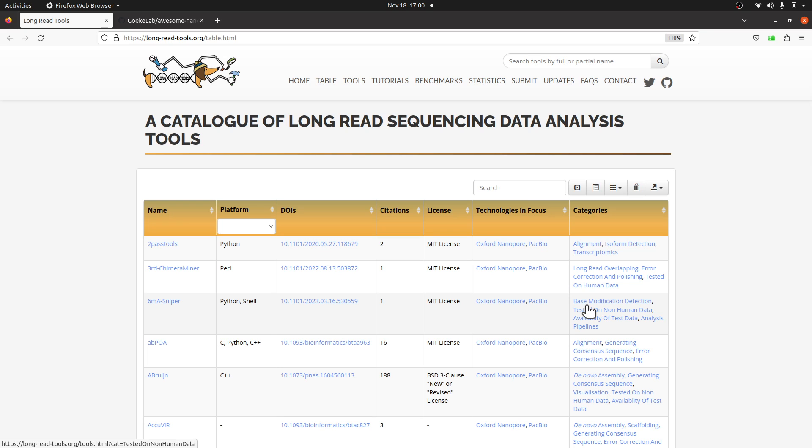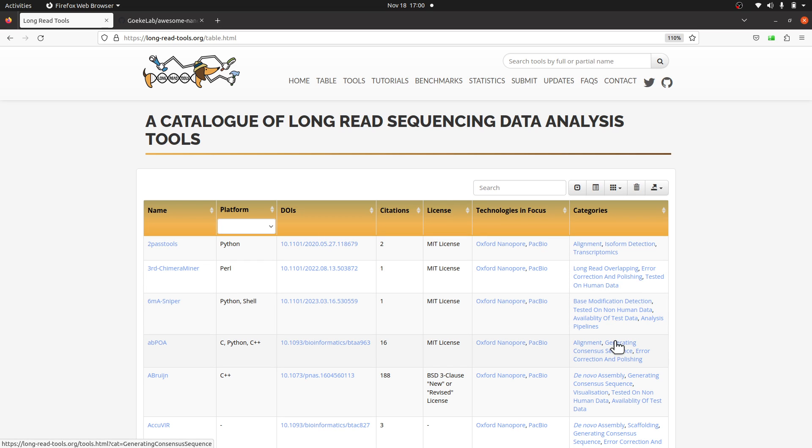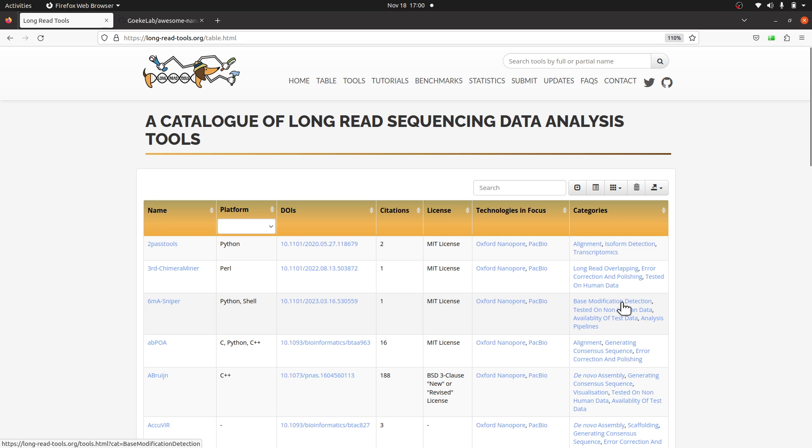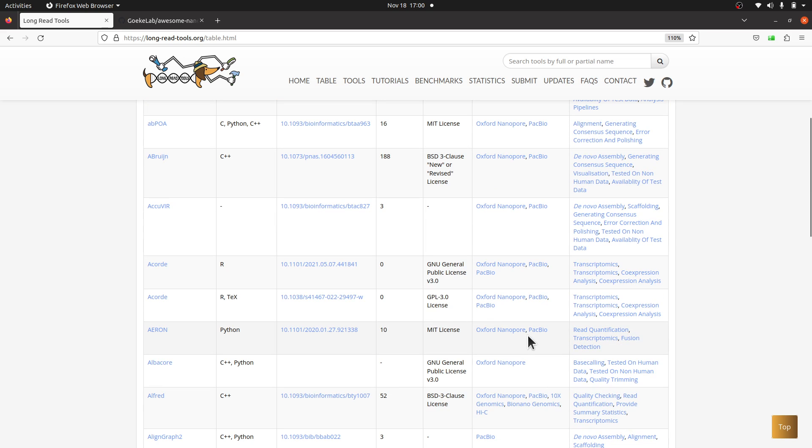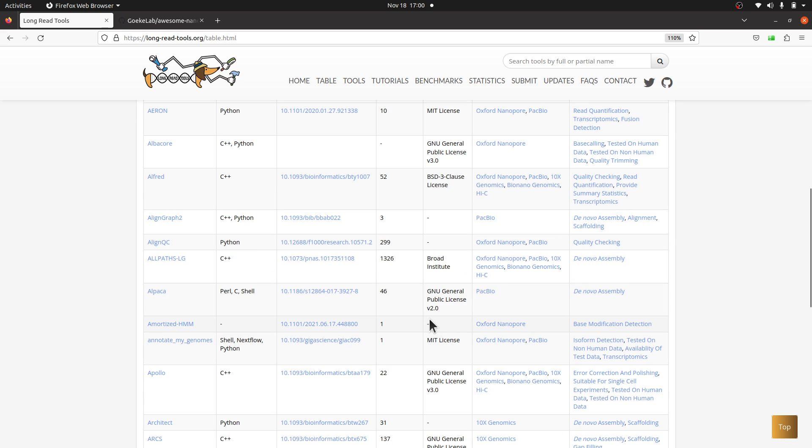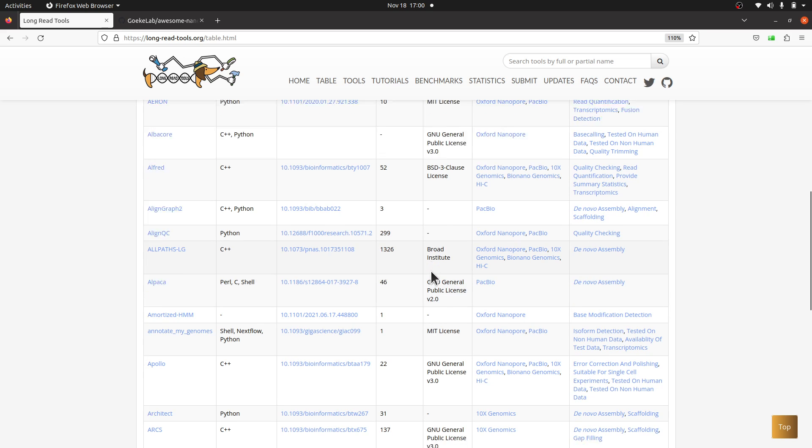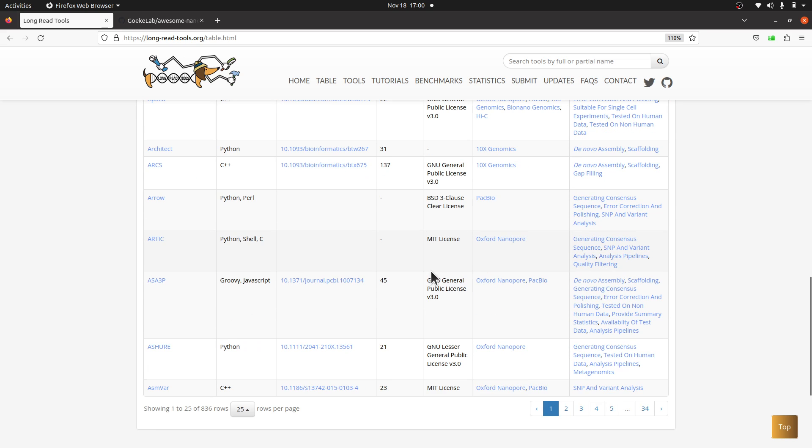It's important to just look at the categories. Take a quick glance, so this will let you have an idea of what the tool does in terms of analysis. If we take a look at, let's say, this one... let's scroll down to see some. Now I'll give an example. If we take a look at, let's say this one, attic.